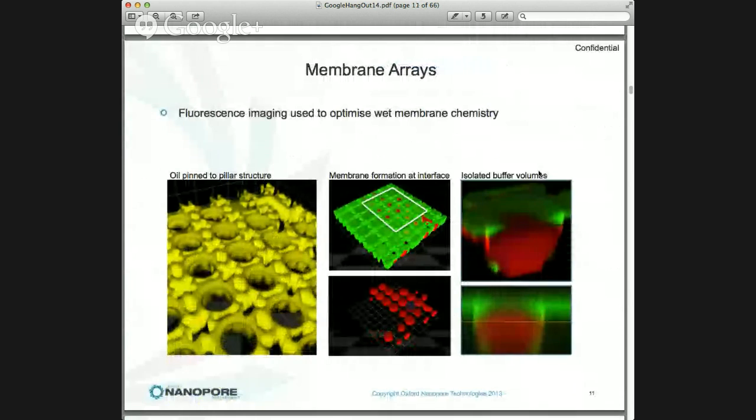Now obviously MinION is designed to come with a shippable pore array, and another thing that people said was impossible was making a shippable pore array, and that's because most of the academic work done to date has been done on Axopatch on lipid bilayer systems. Again, we quickly found that wasn't good enough, so we had to come up with our own system.